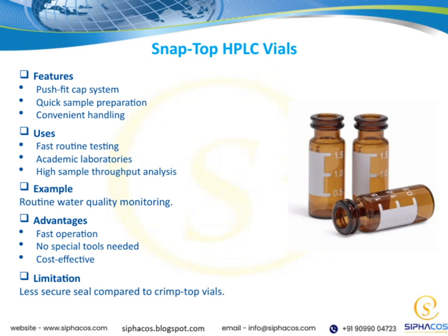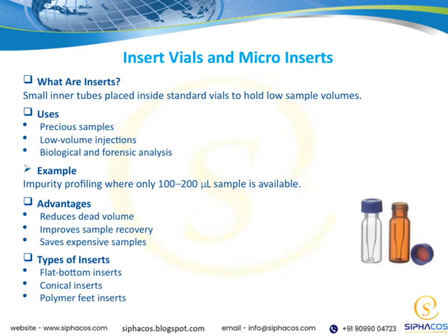Overall, the snap-top HPLC vials are a versatile, efficient choice for many routine analytical tasks, balancing convenience and cost with a few considerations regarding sealing security. Now let's take a closer look at inserts. So, what exactly are inserts?